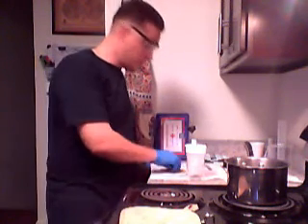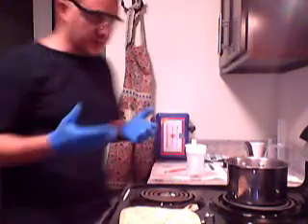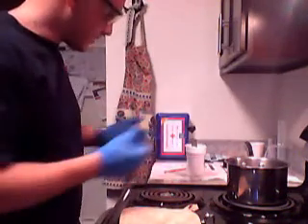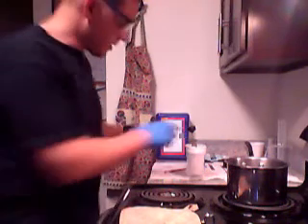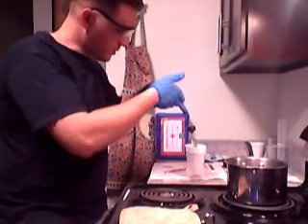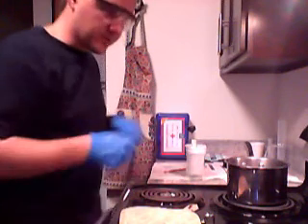Doing steps 2 through 13, and recording my data, but I'm not going to go ahead and do a video on all that, just give you an idea of how it's all set up. I will say when you put the metal in, you kind of want to crisscross so that your thermometer goes at this angle and your metal goes at that angle to keep it from touching each other. That helps out a lot.